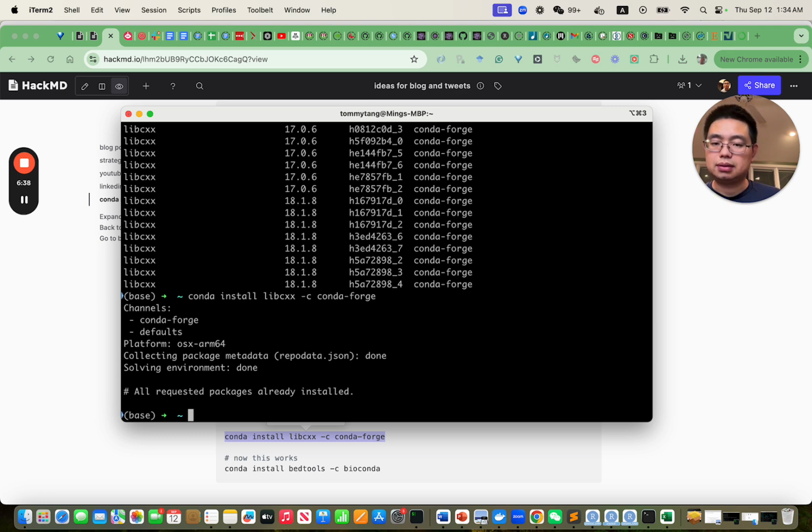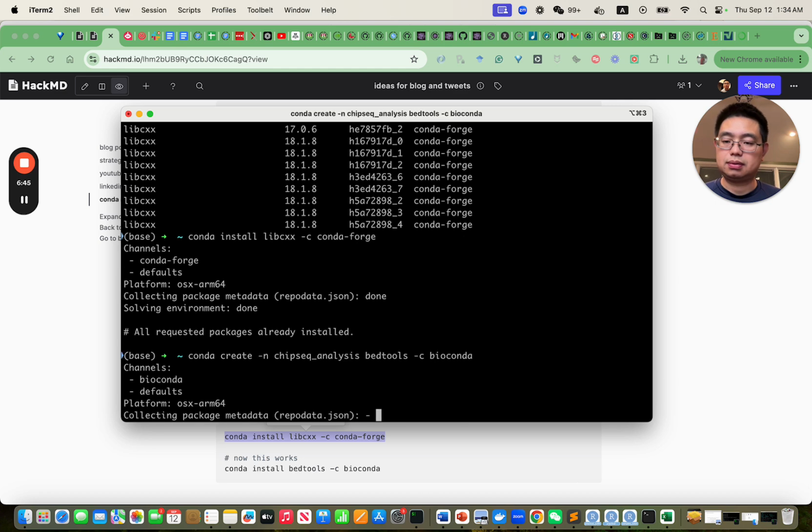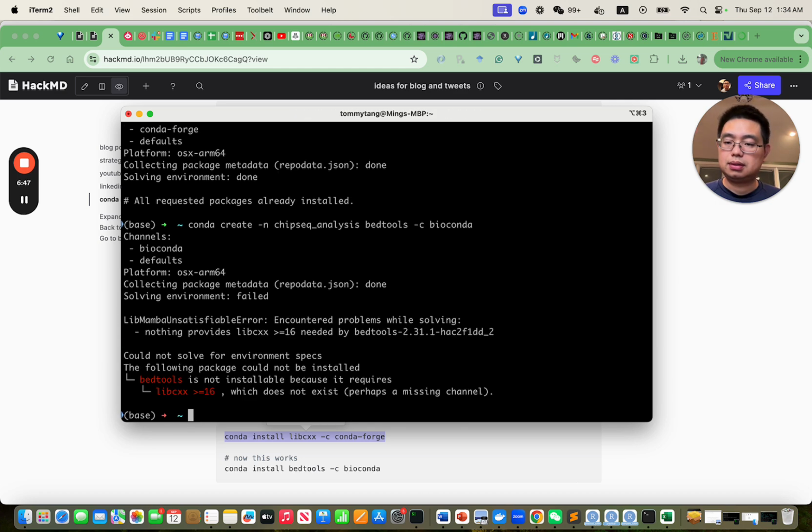Okay, it says it's already installed. Strange. This is a bit strange.